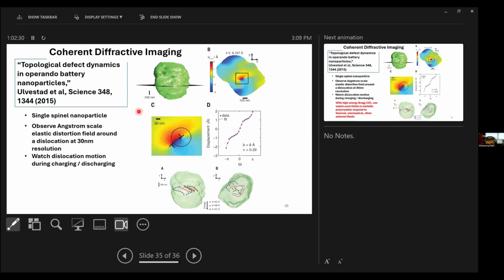Do you happen to know, in the HEXM beamline, the Sector 20, the long straight beamline that you showed in the first slide, what kind of spatial resolution that instrument is aiming at? Well, everything wants to be below a micron. Okay, below micron. Good. So the point of the long beamline is to optimize the focusing optics, and so to be able to get as small a beam as possible.